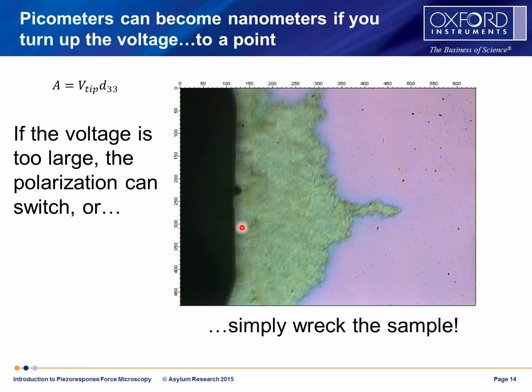This is a photograph. That's the stub of a cantilever that was melted away, burned away by an arc when this film, I think we applied about 100 volts to this thin film here, and reached dielectric breakdown and started to conduct, leaving behind nothing but wreckage and destroying the cantilever.